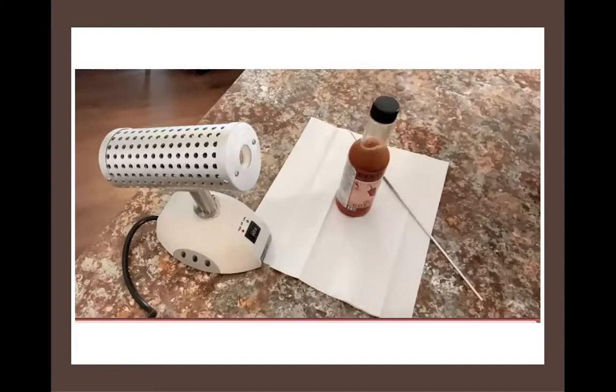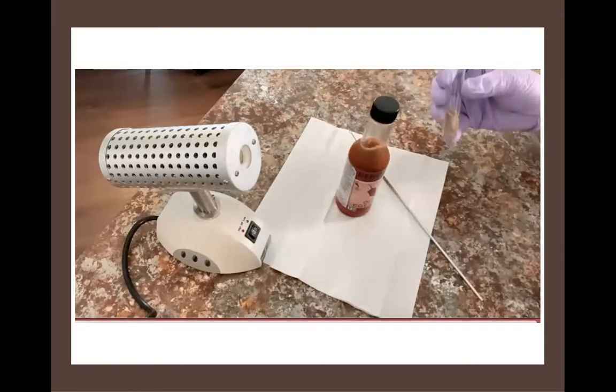Now, the next thing I need is a broth tube. And I want you to notice that it's a glass tube. We've talked about how to open up any test tube with culture in it by holding it at an angle and by holding on to the top of the tube in our fingers. What we need to remember is that the inside of a sterile tube of uninoculated broth is still sterile until we place something into it. The outside of the tube, though, once you have touched it, is no longer sterile.